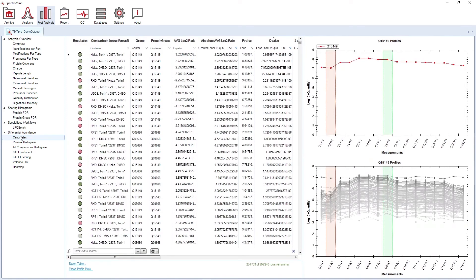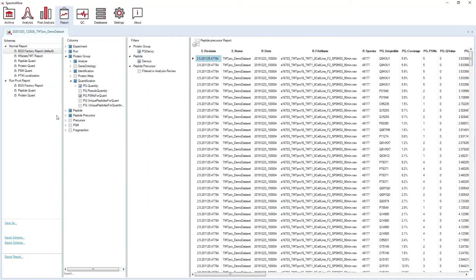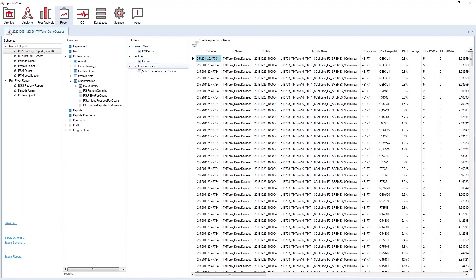If you'd rather export your results, you can go under the report perspective. Here you have fully customizable reports. You can have long and wide format reports. You can include or remove different columns from the report, as well as apply different filters. You can also build custom report templates to automate future exports for any external pipeline that you would like to use.